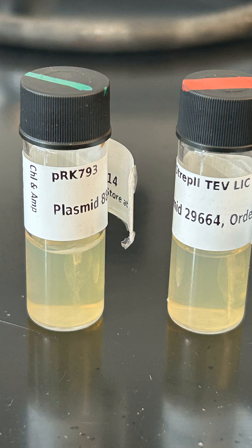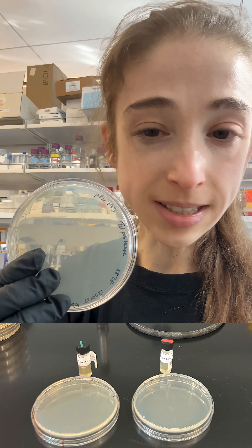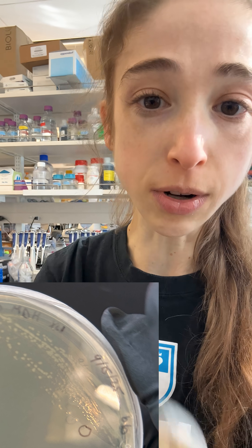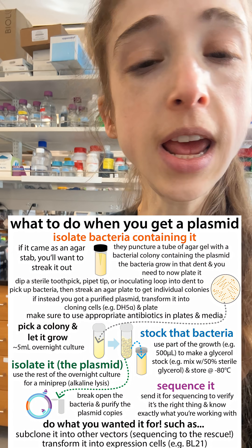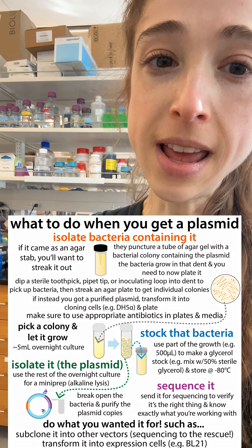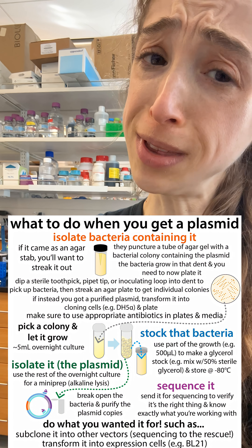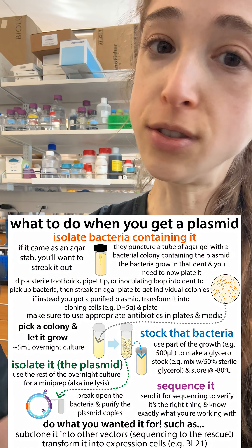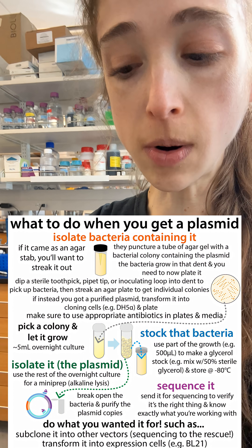When you get your stab, you basically just take a spreader, streak it on the plate, and then you'll hopefully get individual colonies. You can grow up those colonies, make glycerol stocks for longer-term storage, and purify out the plasmid. It's a good idea to actually sequence the plasmid to make sure it's what you ordered, and then you can clone things into it and do any subcloning you want.